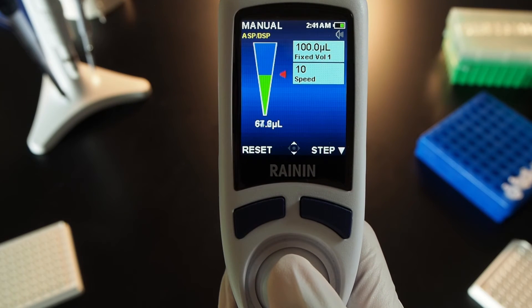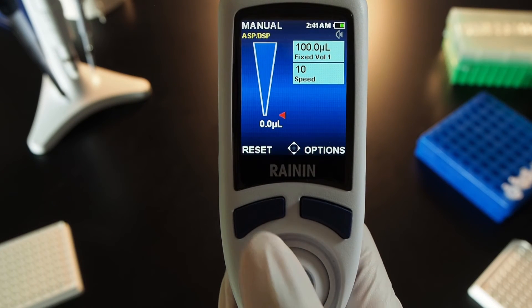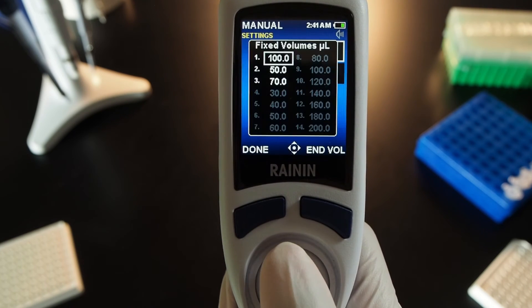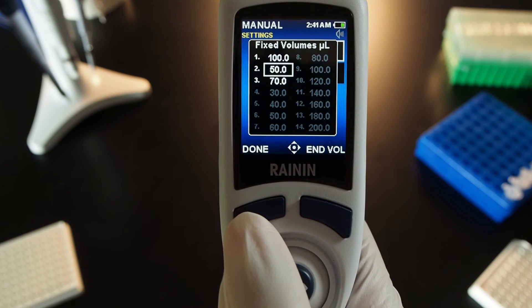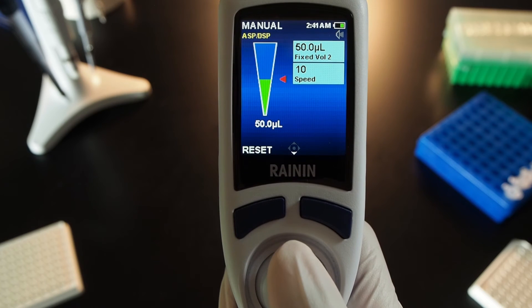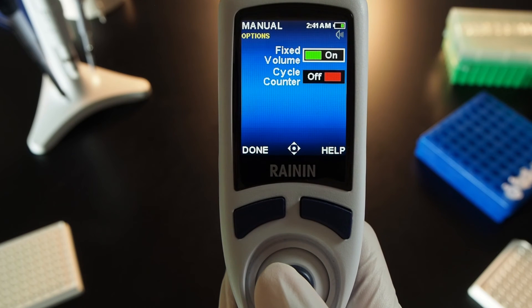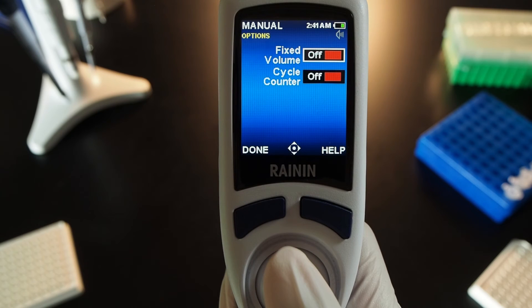Move the joystick up to aspirate and down to dispense. When complete, press reset, move the joystick right, navigate to your next volume, and press done. Press done again, joystick up to aspirate and down to dispense. When complete, press reset, then options, and press the joystick in to turn off a fixed volume.